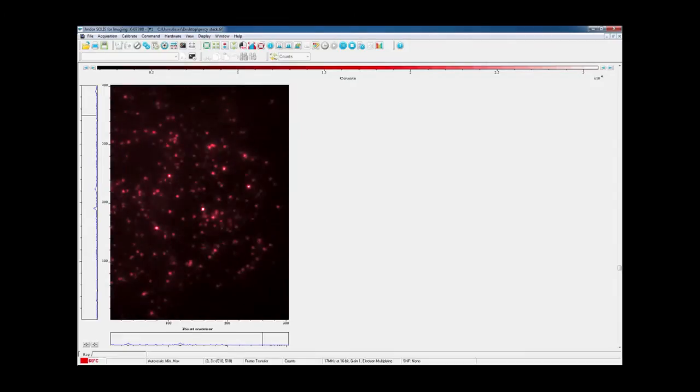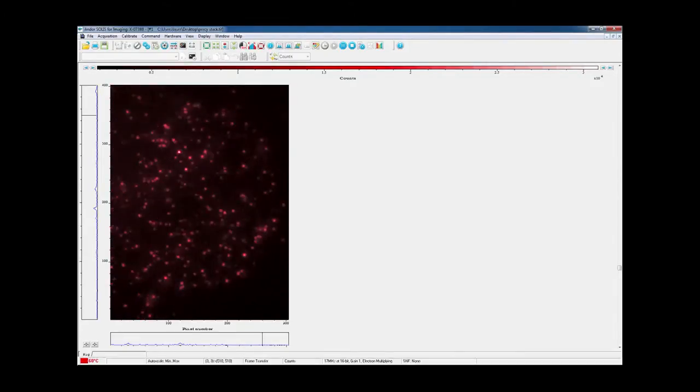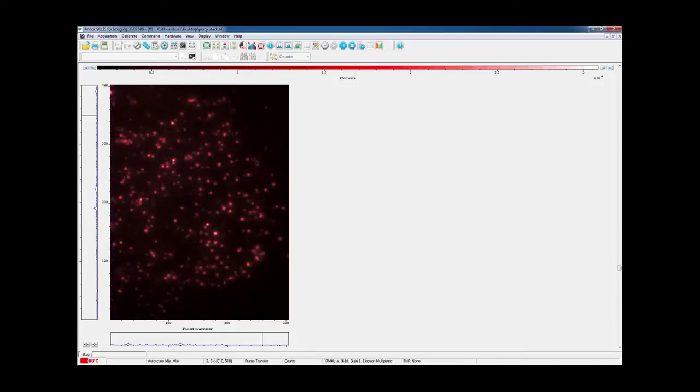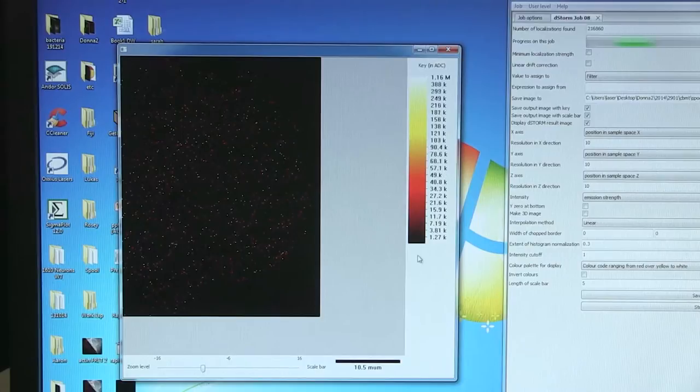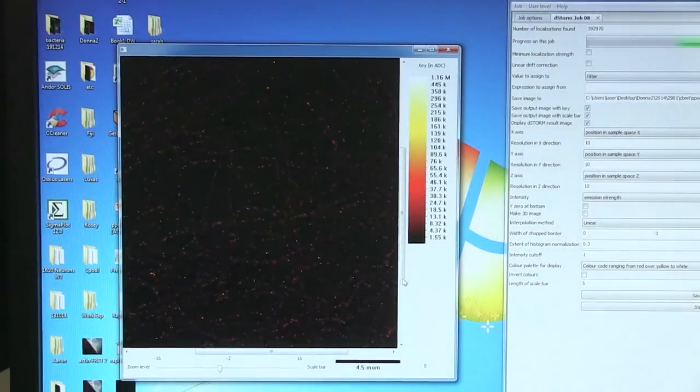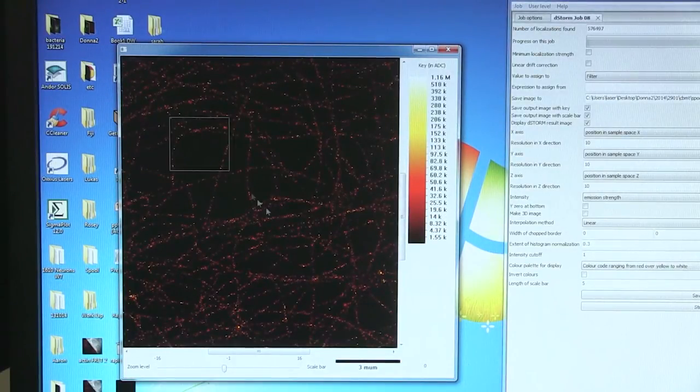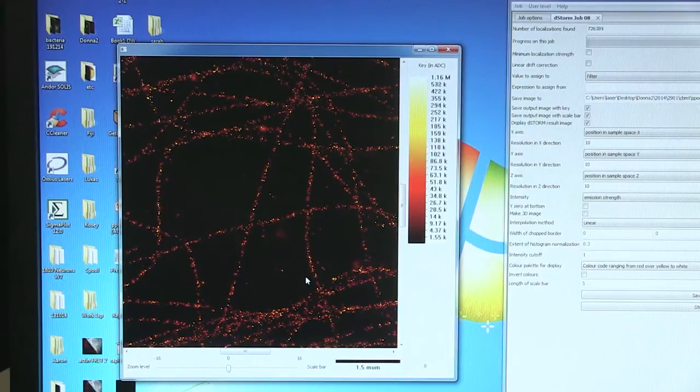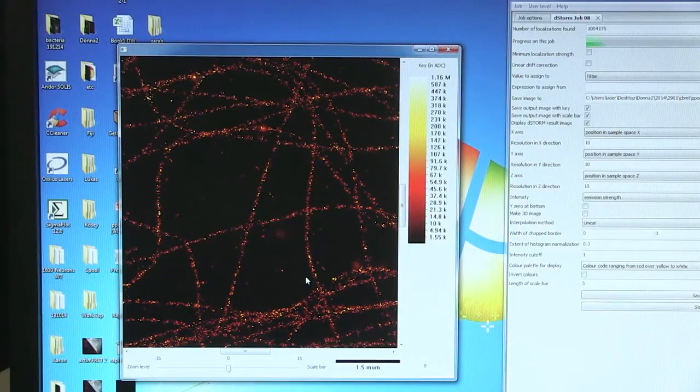You let that run for about 10 to 15,000 frames and then you process that using one of several openly available software suites. So once you've got enough frames we're using RapidStorm and you can just drag your TIFF stack straight in and hit run and that will immediately start to localize these single molecule emissions and plot them onto the final image. In the beginning it's a little bit difficult to see anything but once you zoom in and enough molecules have been localized you start to see microtubules becoming apparent.